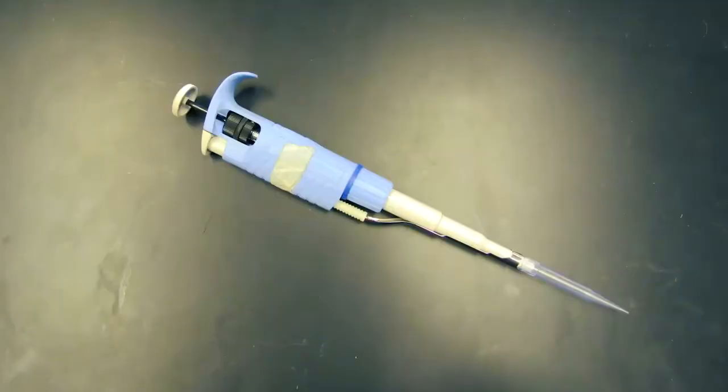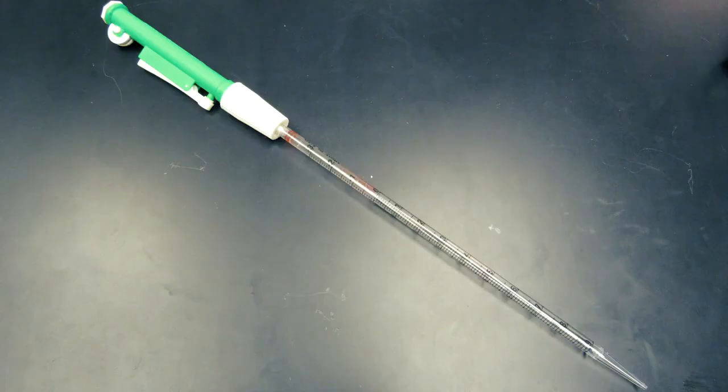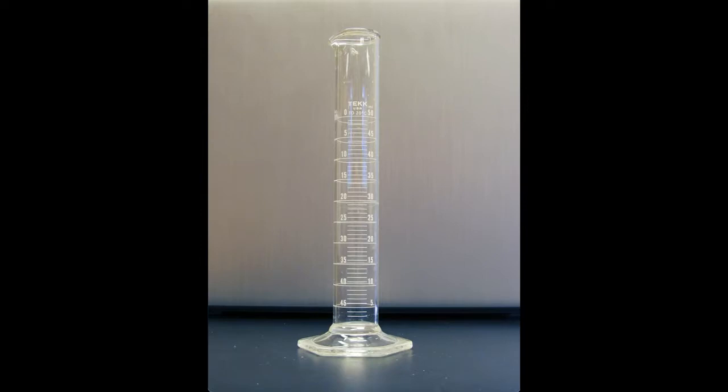Micropipettes are for measuring amounts less than 1 mil. Pipettes are for measuring 1 to 25 mils of liquid, and for liquid amounts greater than 25 mils, you should use a graduated cylinder. When using these measurements, scientists refer to milliliters as mils. Who calls them milliliters?